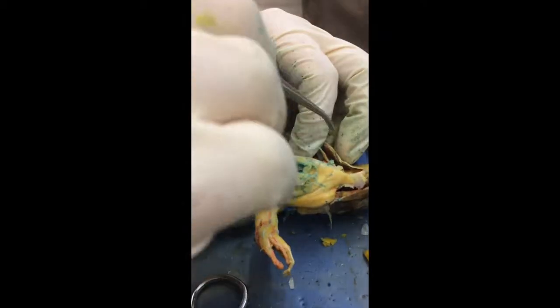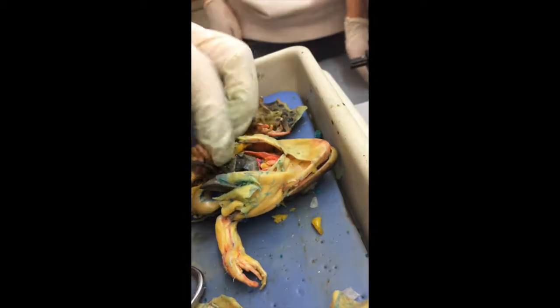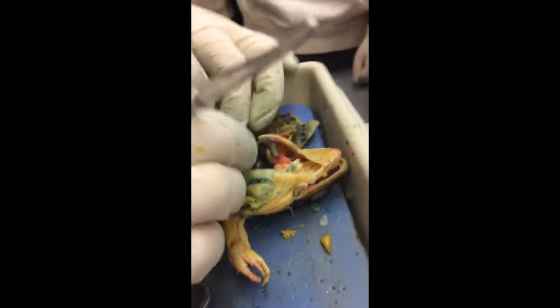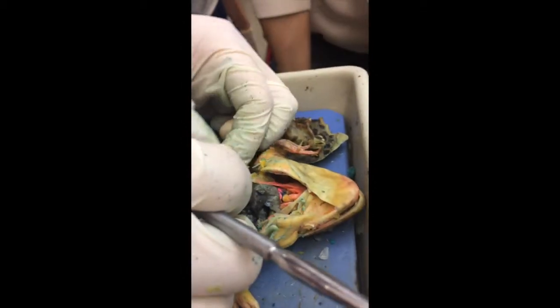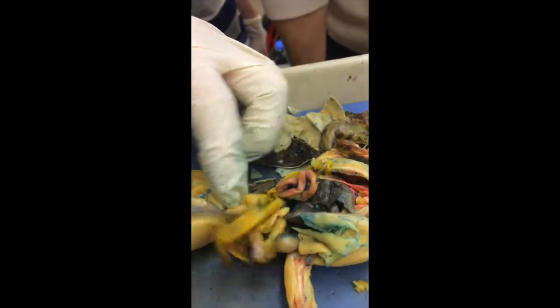Do we know the difference between small and large intestine? Actually, yeah, you could tell the difference between the small and large intestine pretty easily. So where's the large one versus the small one? This is the small intestine, the one that's wrapped around with the mesenteries. And if we follow it, it gets to the large intestine. I called this rectum before. It's actually, sorry about that, large intestine and the cloaca.